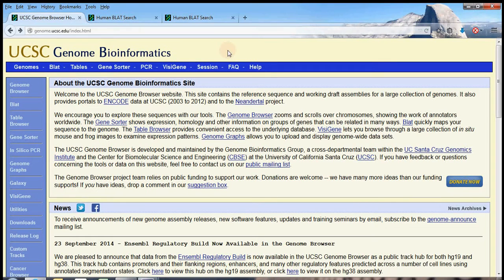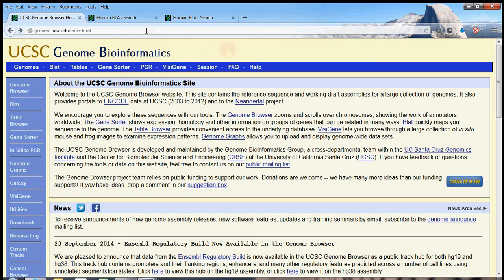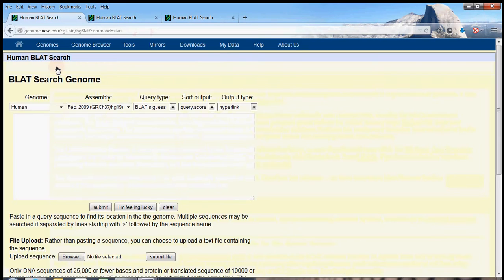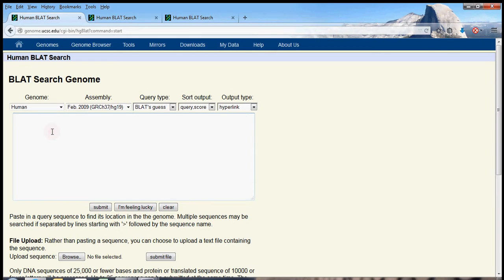In this UCSC Genome Browser tutorial, we're going to talk about a program called BLAT. BLAT is a search tool in which you can enter a nucleotide sequence, and BLAT will try to locate that sequence in the human genome.